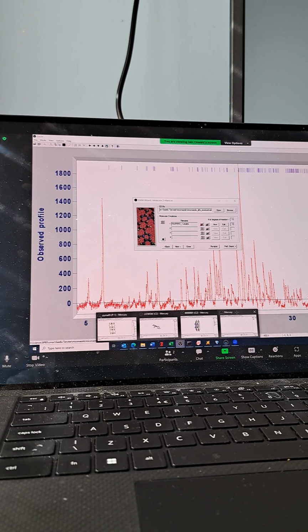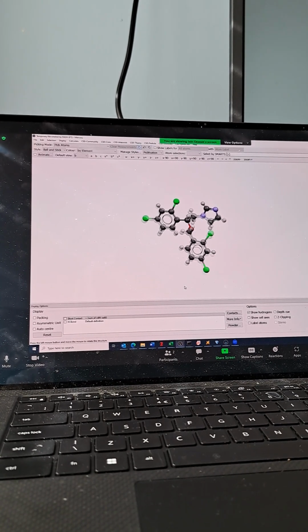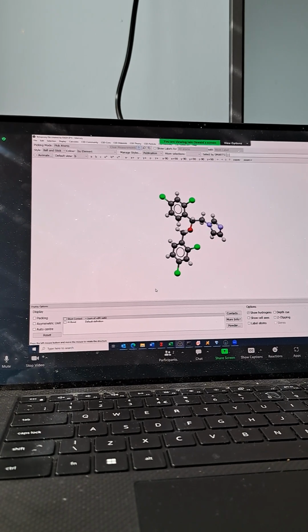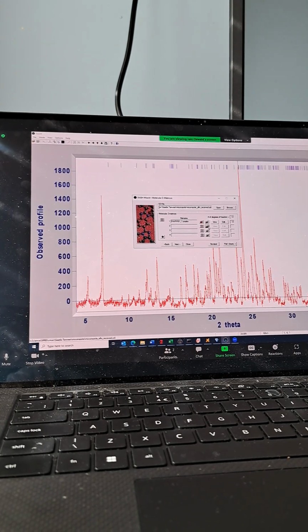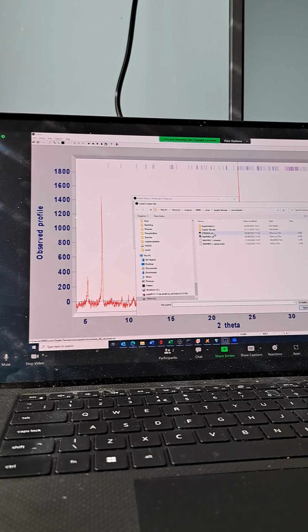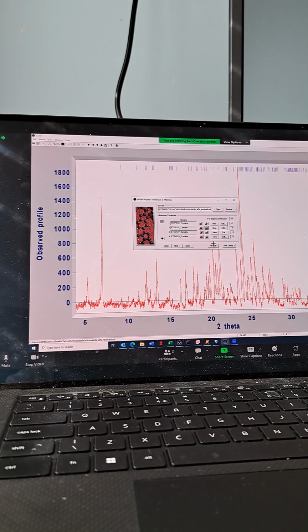So I know that there is a molecule in here. It's giving us a view of what we're putting in. So I now know that molecule is correct. That's the one I want to put in. Now, I did say I also want to maybe put in hydrochloride or something like that. Well, we can do that. Let's just use this. I don't know what this is.